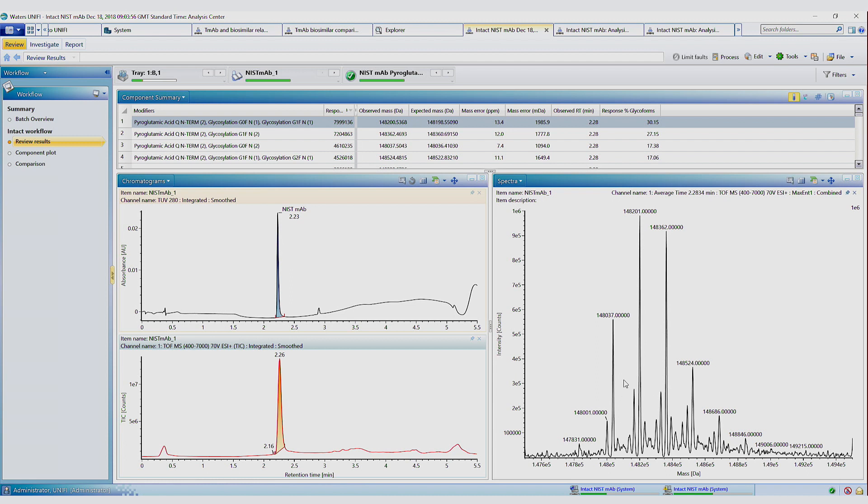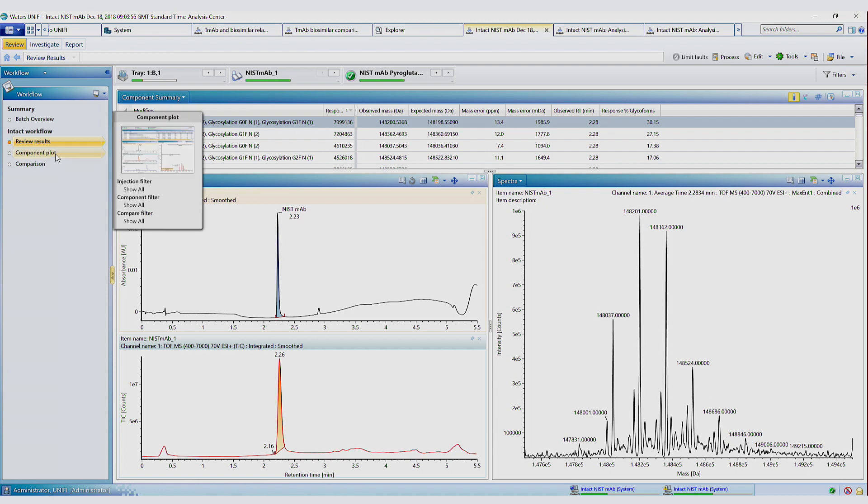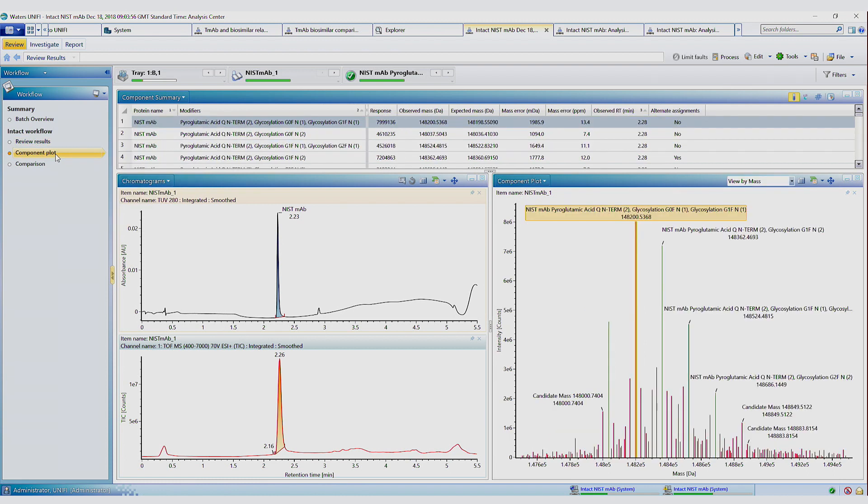If we click onto the next step in our workflow, which is a component plot, we can see here we've identified the major components in the deconvoluted spectrum. And these could be used as attributes for monitoring. So that was intact mass analysis.